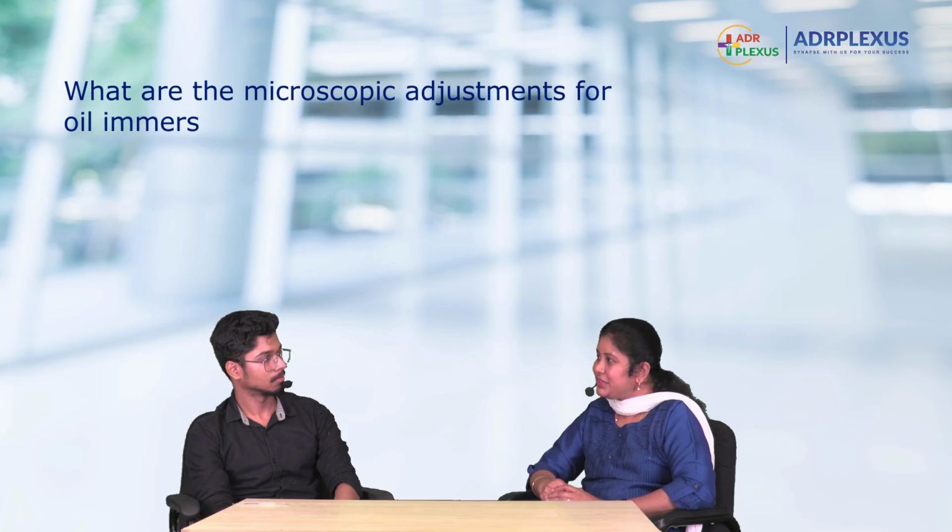Can you tell me what are the microscopic adjustments for oil immersion? The mirror used is plain mirror, ma'am. How will be the condenser? The condenser is fully raised and the diaphragm is fully opened, ma'am. Fully open. Very good. Which objective lens will you use? 100x, 100x oil immersion.